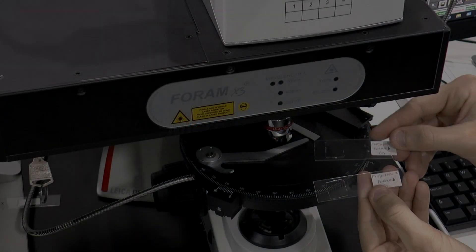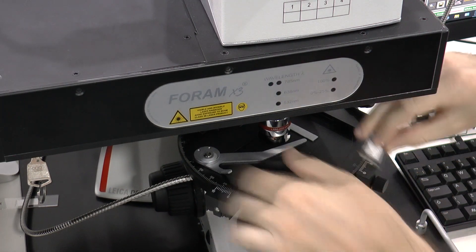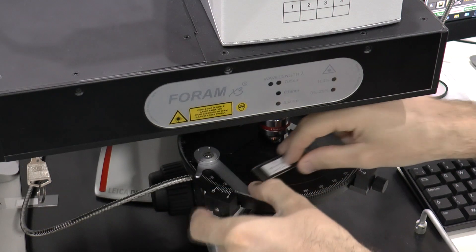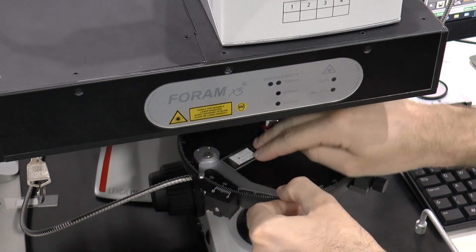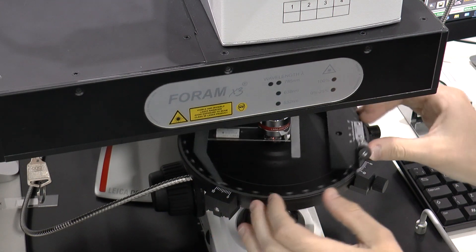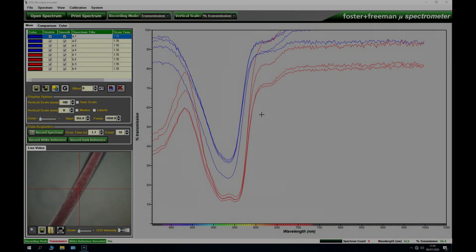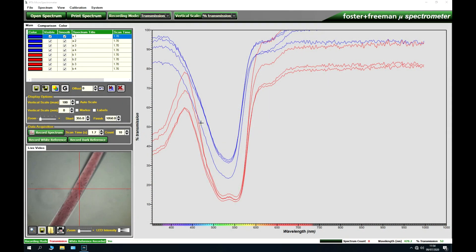Here we demonstrate the FFTA microspectrometer. In this example we have two purple-coloured fibres that we wish to compare. The first sample is placed in for analysis, and here we have the results of the two fibres, which initially seem quite similar as the colours are very similar themselves.